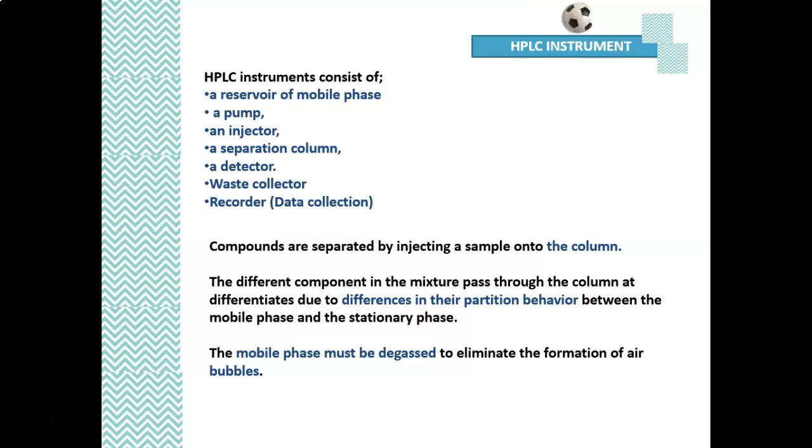So you can determine the non-polar compound that elutes first, what component that is. Okay, so the polar compound that is retained in the stationary phase, you can also determine by figuring it out based on the peak appearing on the chromatogram.